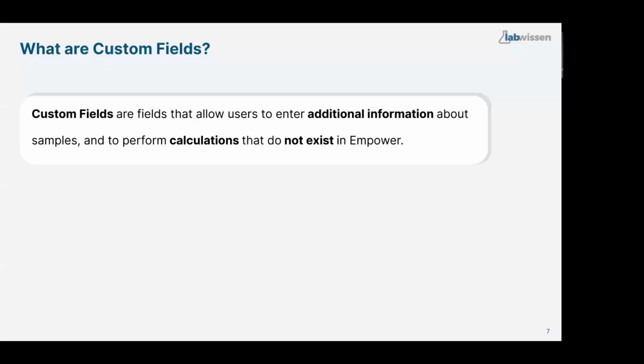But of course, developers cannot put all necessary calculations in Empower, and often you need to do your calculations in Excel, so outside of the software. Instead of doing this, there is this custom fields function that allows you to personalize your Empower, to develop your own calculation inside. And also you can use custom fields to enter additional information about your samples, about your analysis.